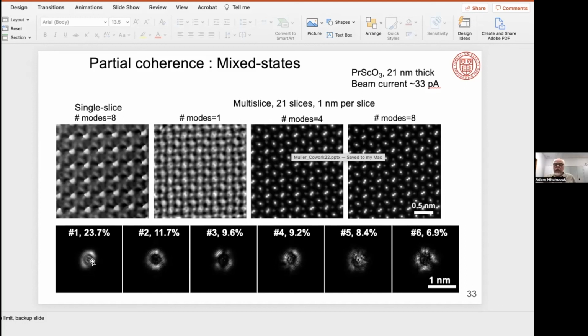Yeah, hi, David. Excellent talk. It's just amazing, blows me away. I was wondering if you could comment a little bit with respect to the impact of these ptychographic methods on the question of radiation damage in TEM, which is generally one of the most limiting aspects. Is that a real game changer?